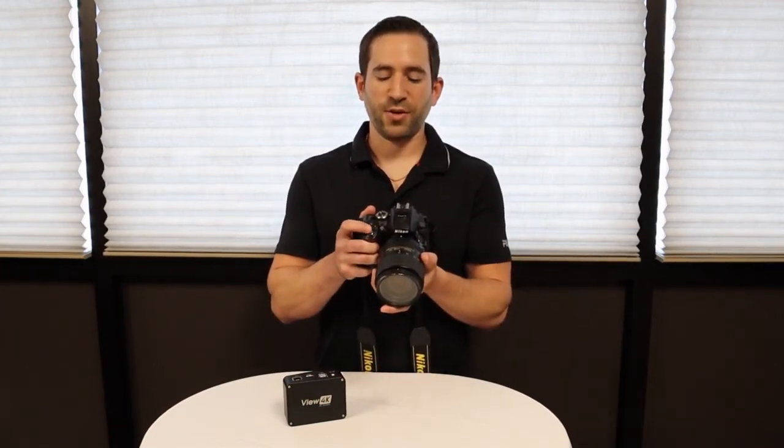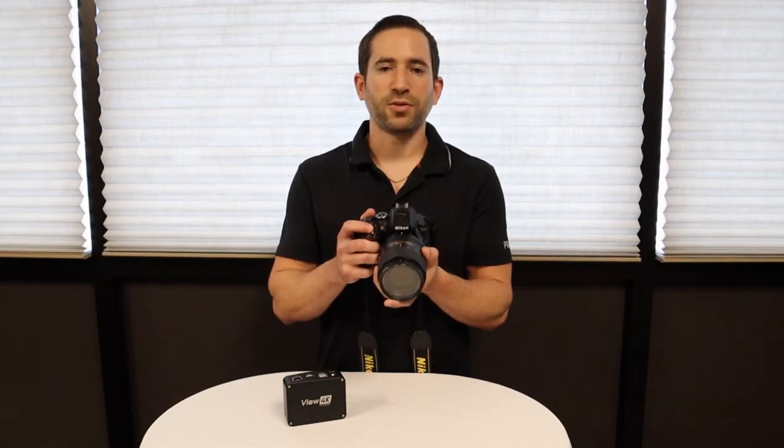That means it has more light gathering capability, better resolution, better frame rate, and is an overall better camera when it comes to microscopy. There are also some disadvantages of using your camera when it comes to controlling it. If you capture your image by touching the capture button, you're going to vibrate the camera, which can result in a blurry image or removing your sample.